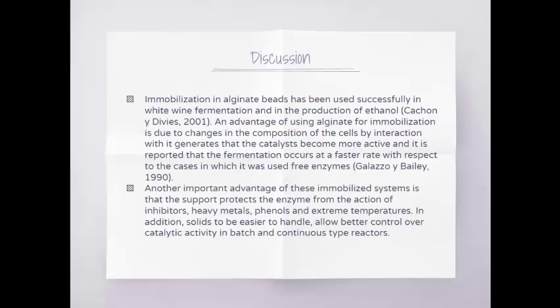Another important advantage of this immobilized system is that the support protects the enzyme from the action of inhibitors, heavy metals, phenols, and extreme temperatures. In addition, solids are easier to handle and allow better control over the catalytic activity in batch and continuous type reactors.